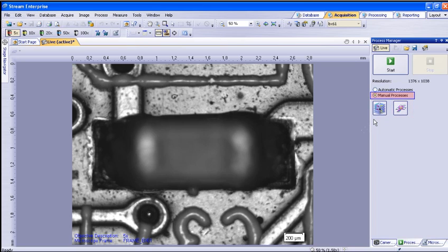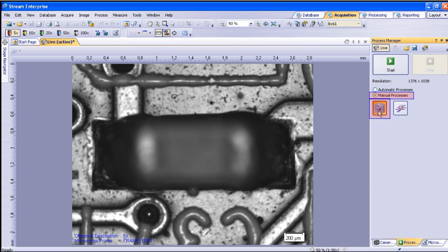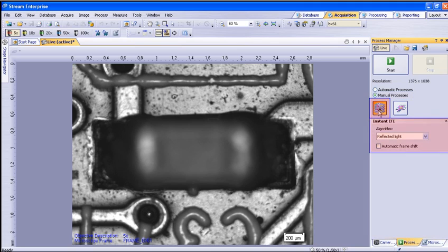The manual processes are available in Stream Essentials, Motion, or Enterprise. You will want to select the Instant EFI button to begin generating your extended focal image. Once the settings open, you will have the ability to choose the algorithm to apply for the type of image you will be capturing.